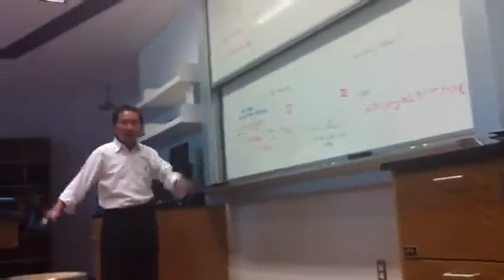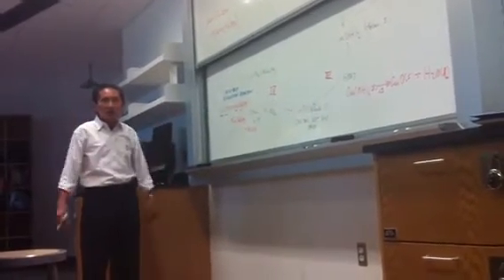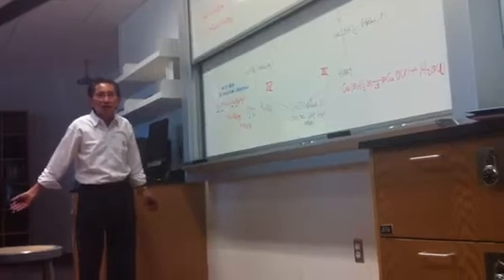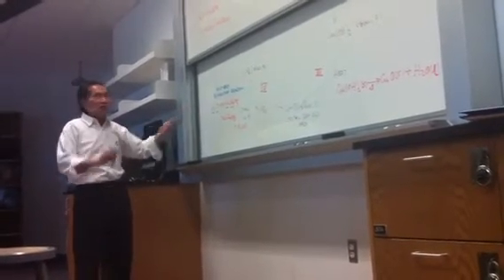Hydrogen hasn't changed its oxidation number. SO4, the whole unit, hasn't changed its number. So that's not a redox reaction. That is acid base or dissolution. Okay, now you have copper sulfate, the blue solution.